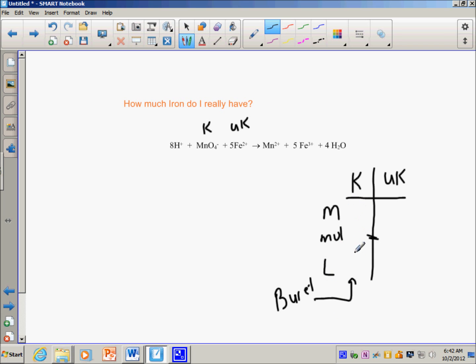This is the volume. So out of this thing here, every single titration, we would have a start value, an end value, and we just simply record it, and that would be our change in volume. That will be usually in milliliters, converted over to liters. Solve for the moles at, in this case, a 1:5 ratio, so this is going to get multiplied times 5 to get this. Okay, we now would have our moles of our iron.